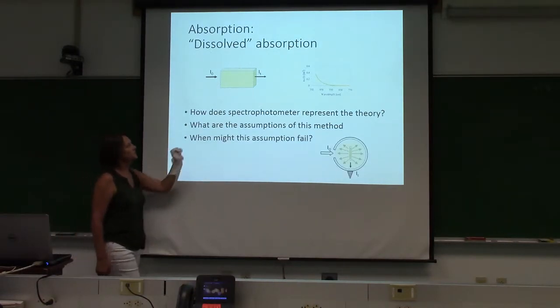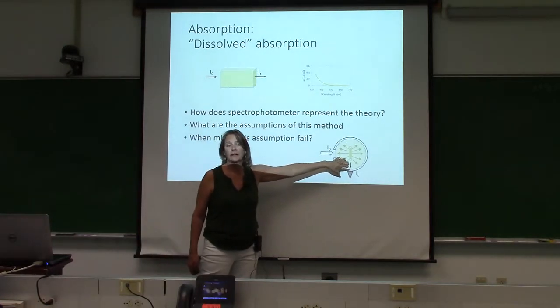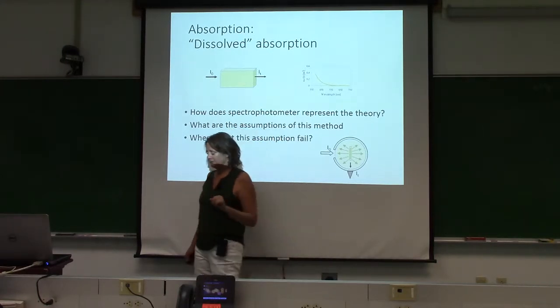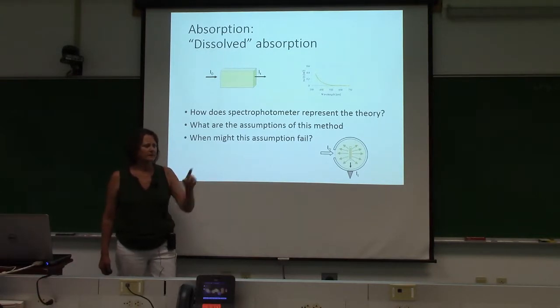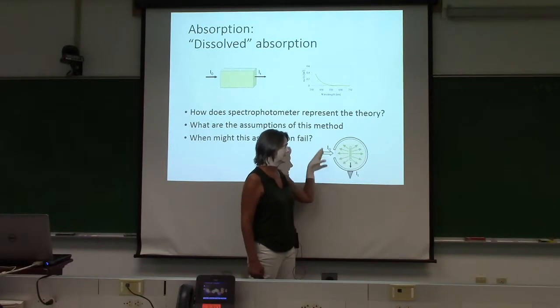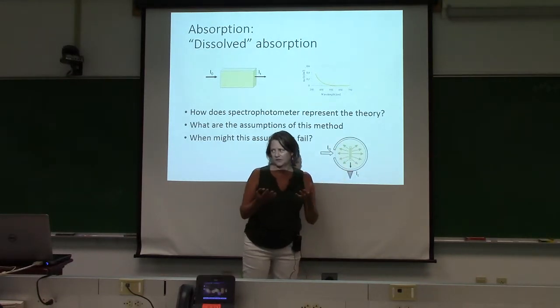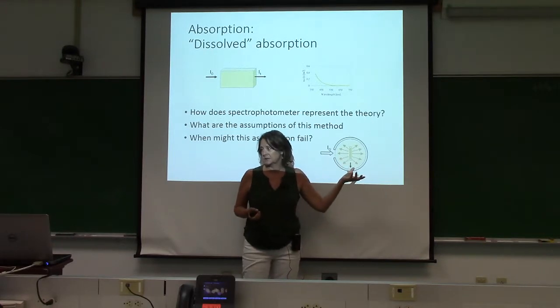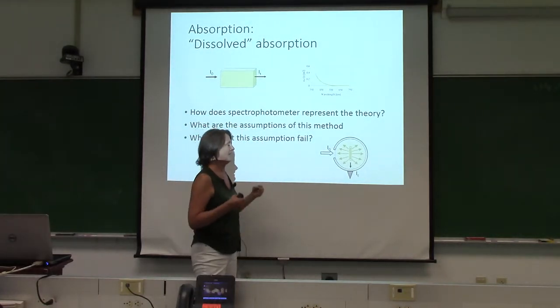Another approach, instead of measuring it through a cuvette of this configuration, is measuring it in an integrating sphere, an integrating cavity absorption meter. I was just recently on a cruise in February with Rudy Rutgers, who is in Hamburg. He designed an integrating cavity that's made of Teflon, which is a highly scattering surface. You fill the cavity with your CDOM sample. Then he slams it on the counter to get all the bubbles out, and you're like, ah! But it's definitely made to be used at sea.